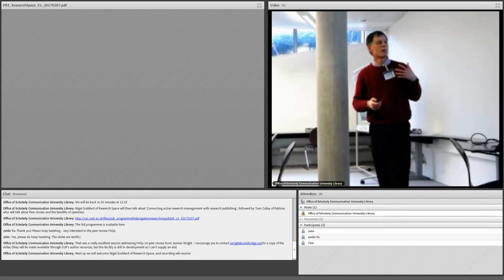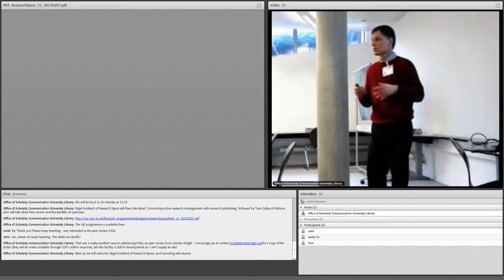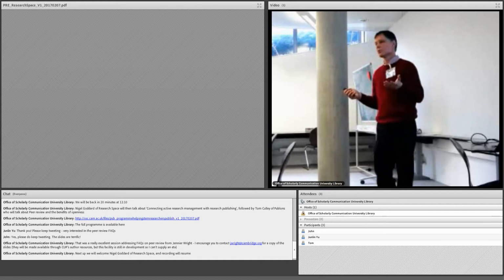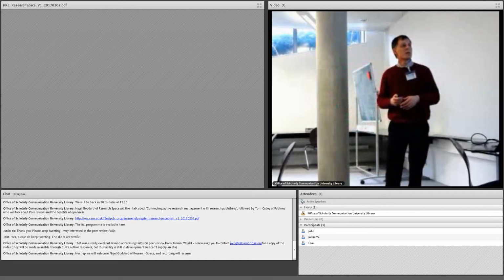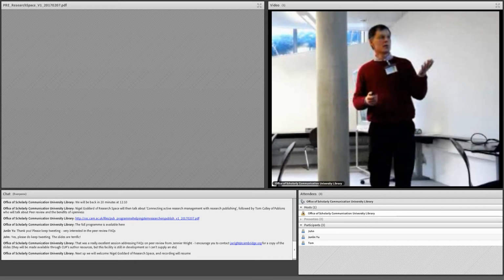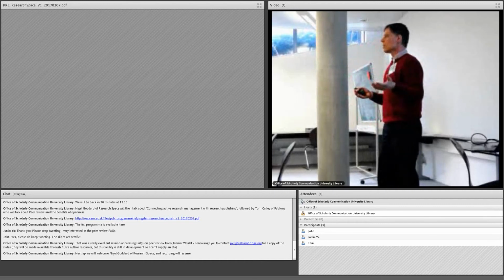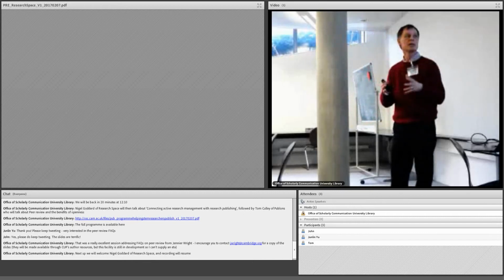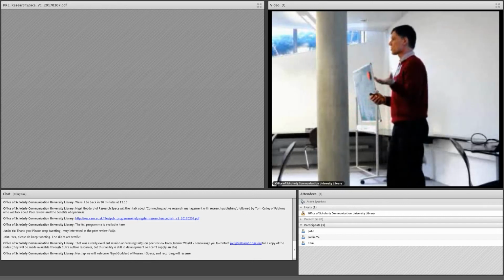So what we see is that you need some sort of mechanism to streamline this. And we think that electronic lab notebooks are one of the answers. They're suited to this function because they solve this data collection problem, where people used to write things down in notebooks. If you have an electronic lab notebook, now your information is electronic. And more to the point, it's structured.